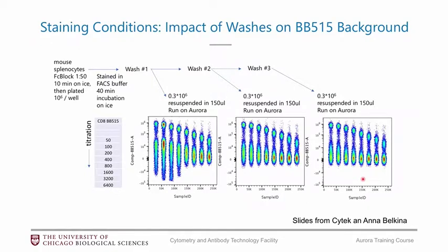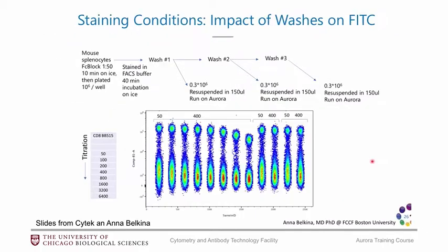A specific note about BB-515: it was discovered in the SciTech user group meeting that doing only one wash after staining with BB-515 causes unusual spreading in the negative population. Doing two to three washes results in a much cleaner negative population. This issue does not occur with FITC. So if you have BB-515 in your panel, make sure to do at least two washes after staining.